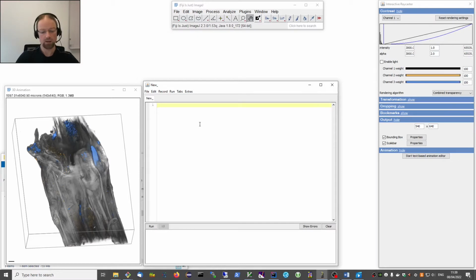Just remember typing F. I type F and everything else will be auto-completed. Now I need to enter a frame number, and frame here means the frame in the video which we will create. We'll start at the beginning at frame 0 and I hit space, and you can see that the editor again auto-completes as much as it can. Now we need to give an end frame. Let's say we do something within 100 frames.